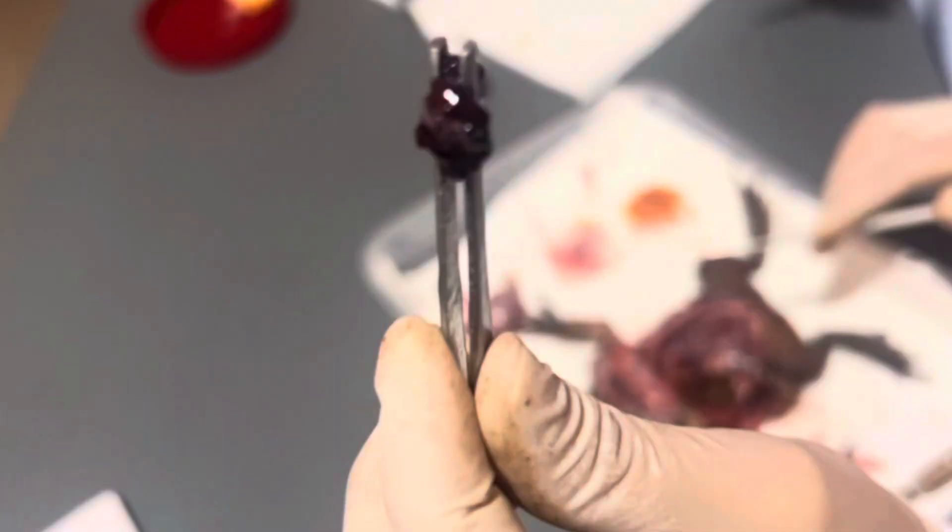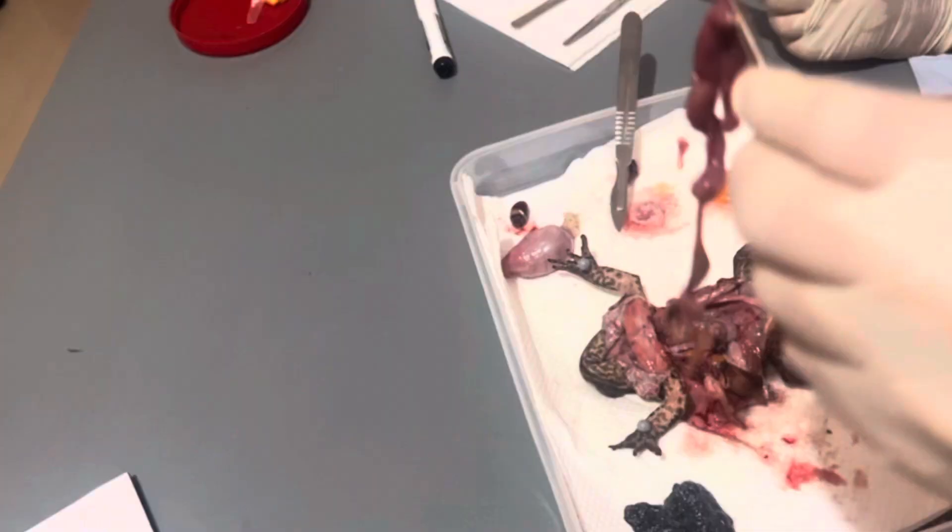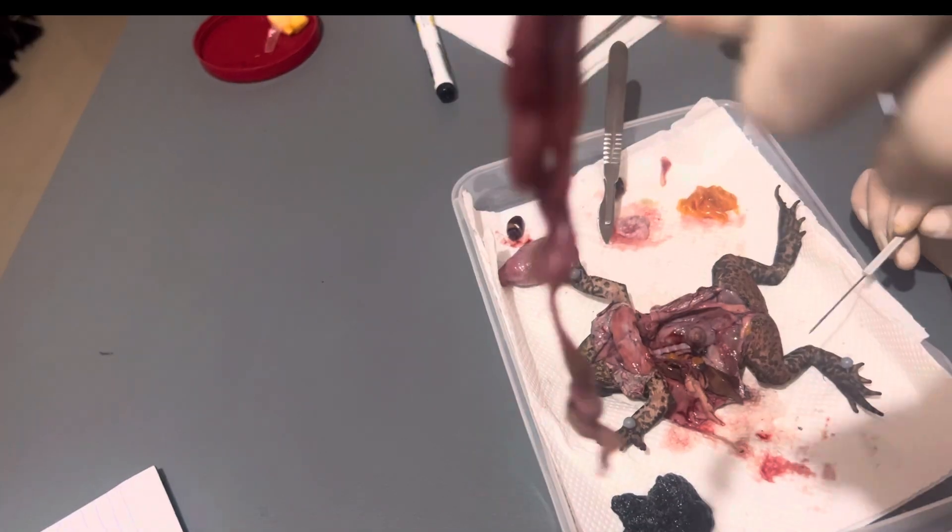Here is the gallbladder — this is where the bile that comes from the liver is stored. This is the small intestine of the toad. This is where the final stage of digestion occurs and where nutrients are absorbed.